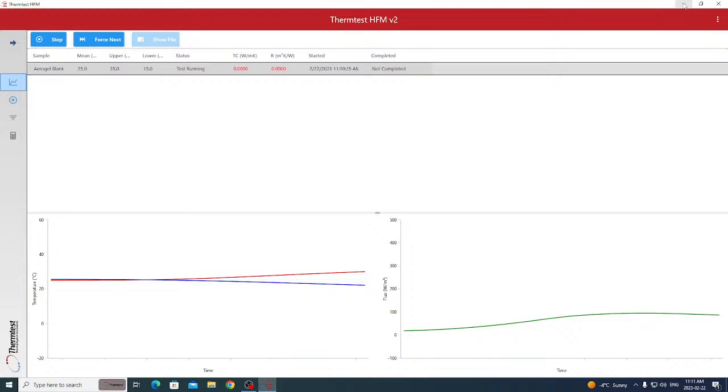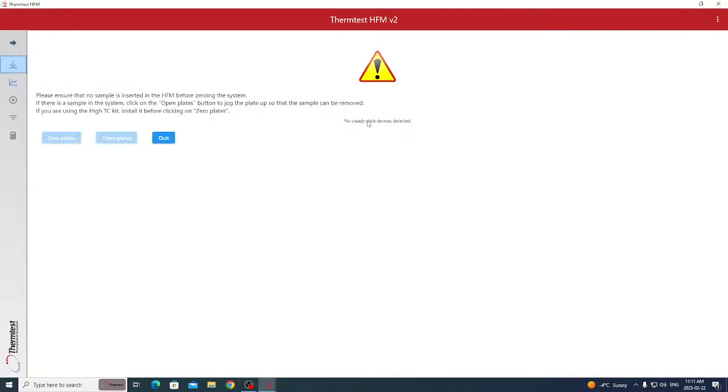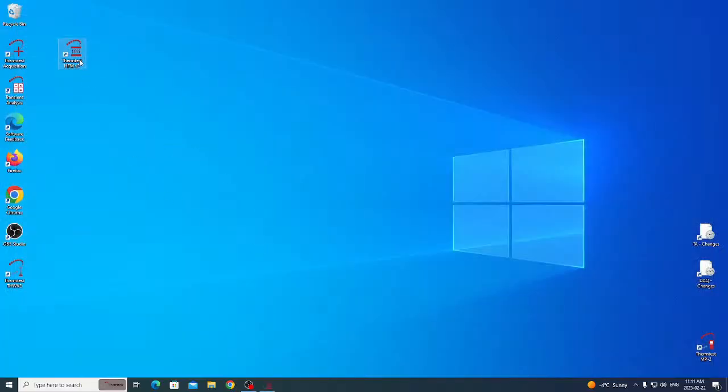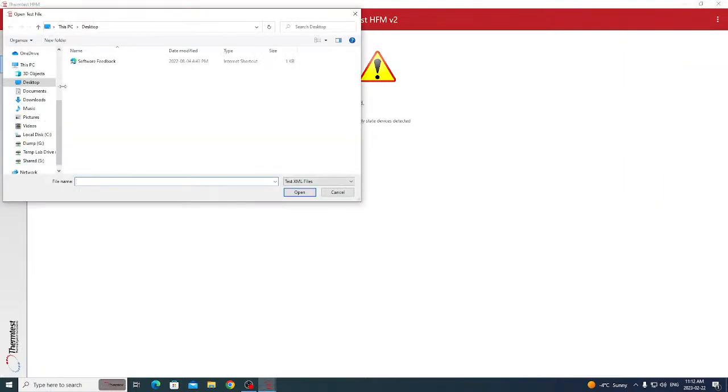So let's open up the software again. We're not going to let it detect itself. We'll just use that for reviewing the software. So we're going to quit. Oh, I didn't mean to quit. I mean, we're not going to let it detect itself. So we're going to open an experiment.